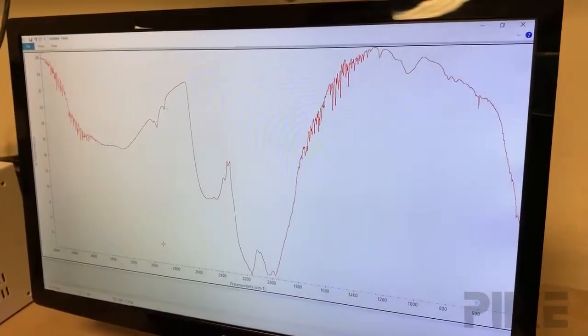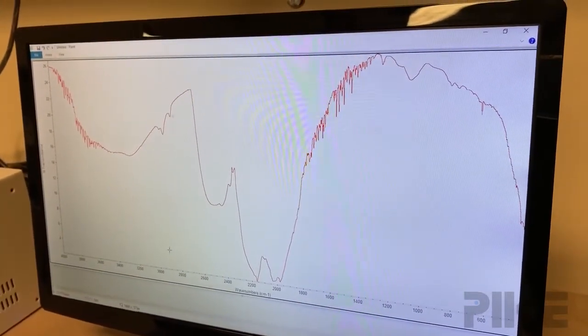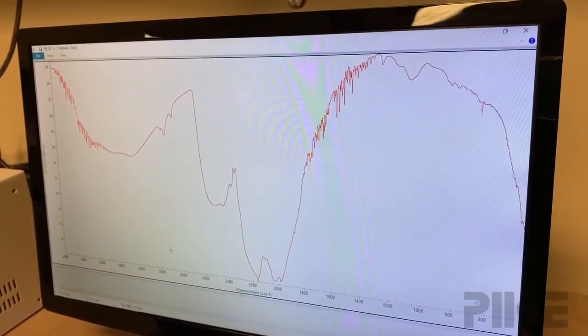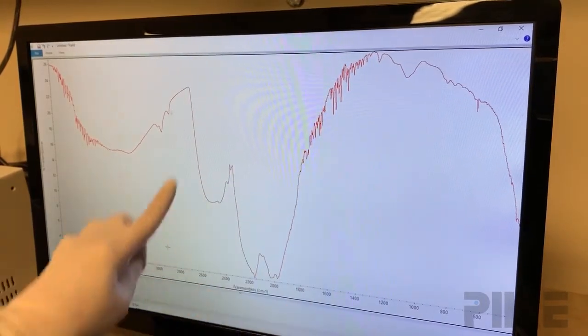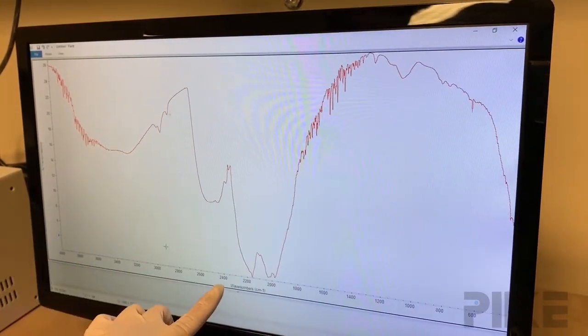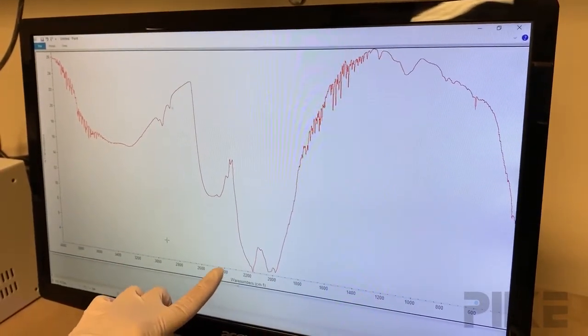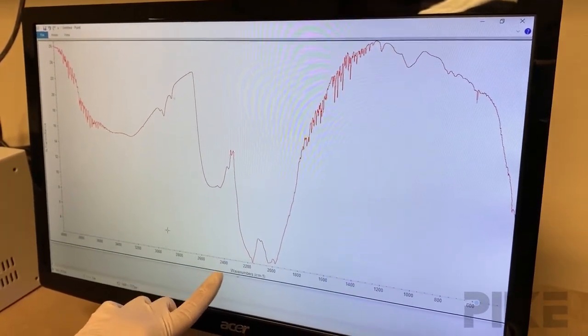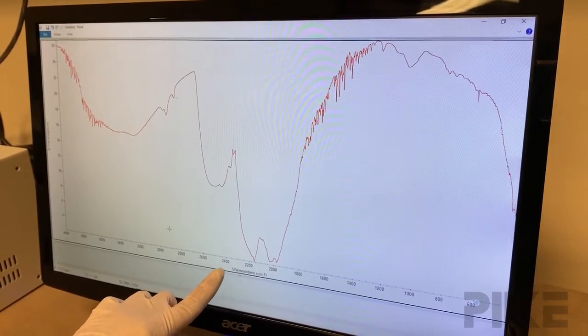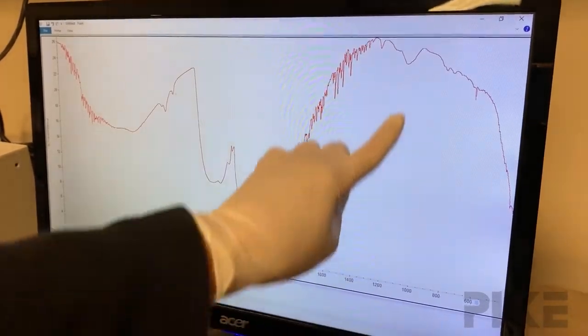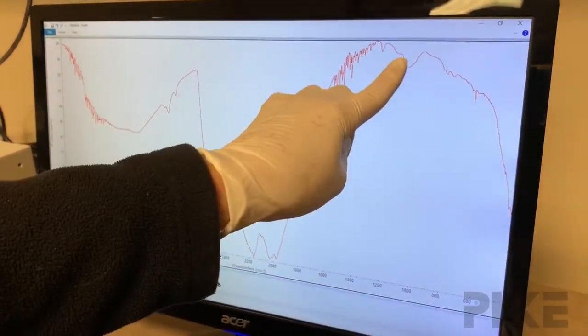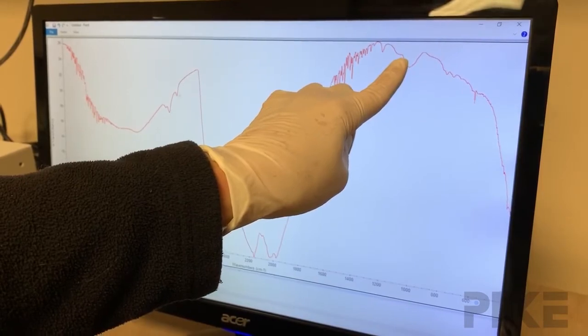Let me show you an example of a typical energy throughput spectrum for a diamond. You'll notice the diamond does not transmit infrared in this region — that's because of the diamond phonon bands. What we would look for in a diamond ATR is to check the energy throughput at 1000 wavenumbers.